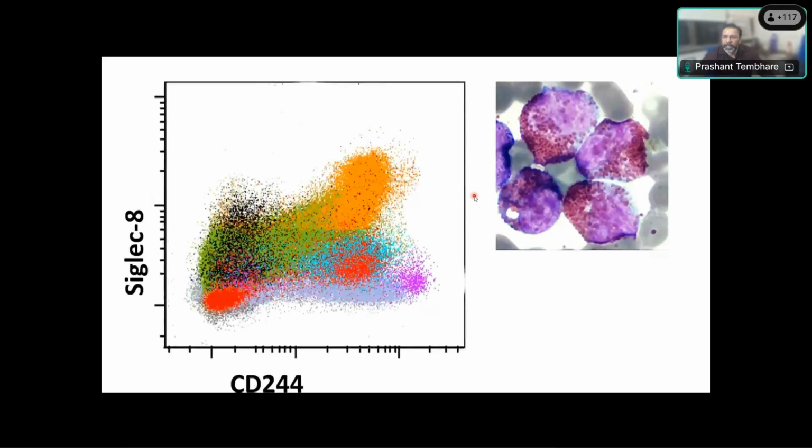Okay, let's go to the eosinophil. Now, eosinophil maturation is not well studied. There are only 1 or 2 studies, and we have studied it in our lab, so I am showing you the data from our lab. Now we know that these are the eosinophils. We need to study specific markers. I will just run through it because we have a time limitation, and it is not very well needed or used for clinical application, but this is for the purpose of students to know that it can be studied like that.